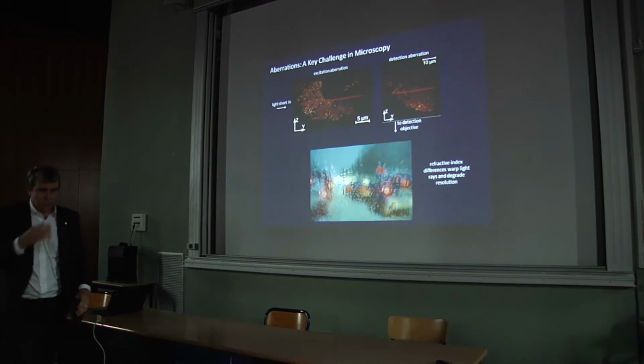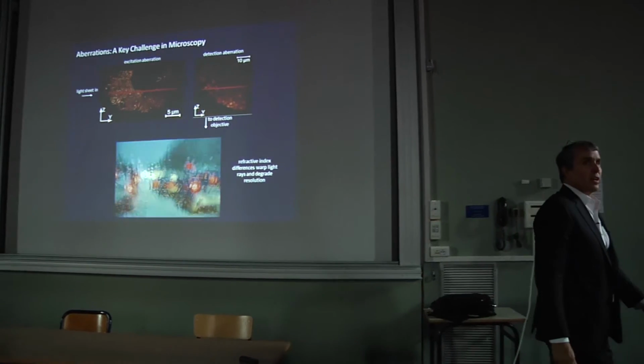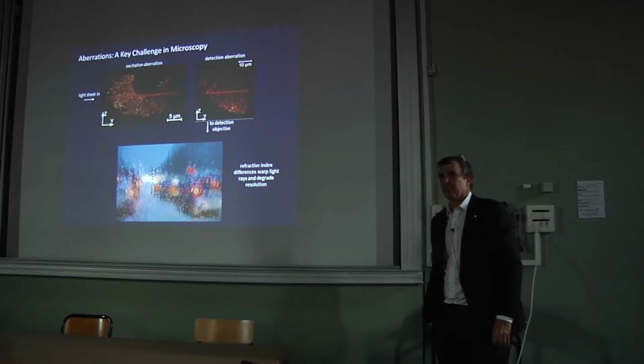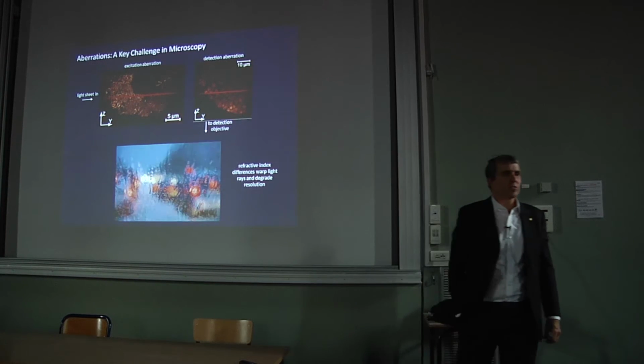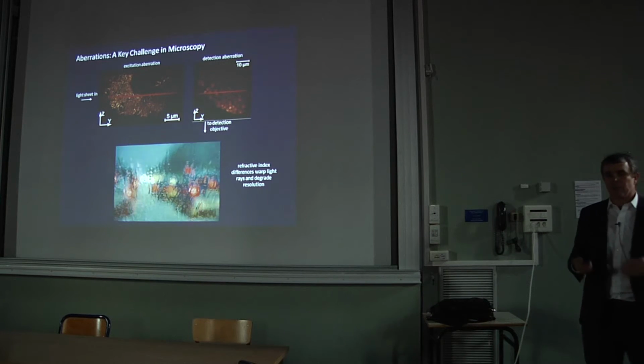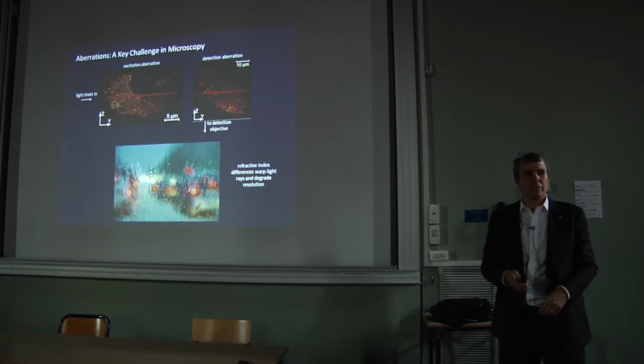So the final topic. The problem going forward is that too much of our understanding of cell biology comes from looking at cells on coverslips. But they certainly didn't evolve there. So we need the ability to look at them in the whole organism, where there's all sorts of cell signaling and other stuff going on.